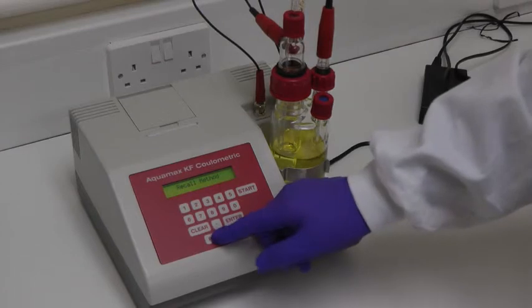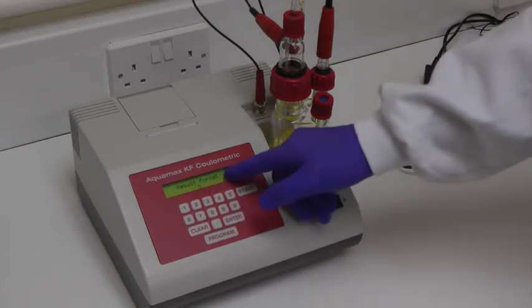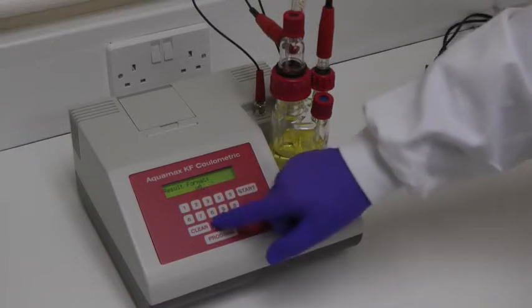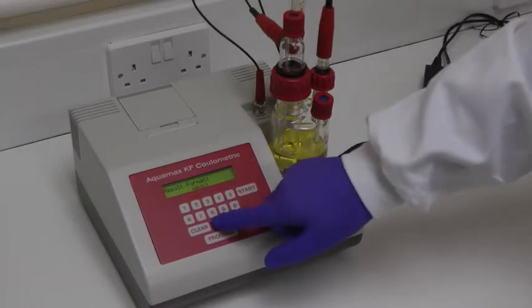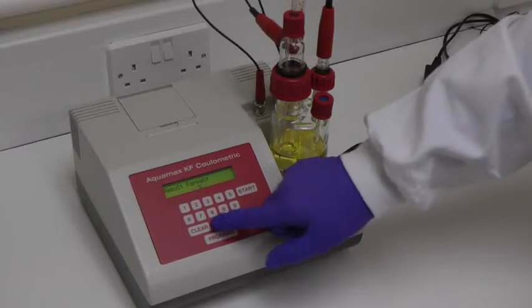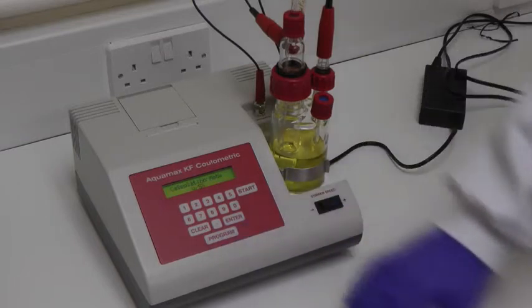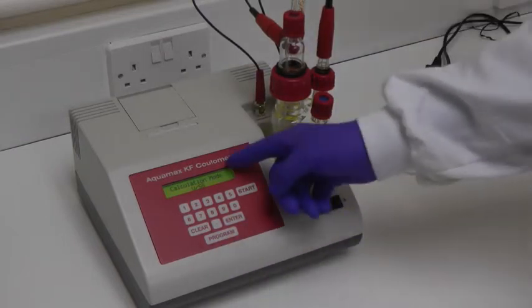The next parameter is Result Format. Pressing the decimal point will cycle the format through microgram, ppm, mg per kilogram, and percentage. Press Enter to select the required format, and then Enter again to move to the next parameter.